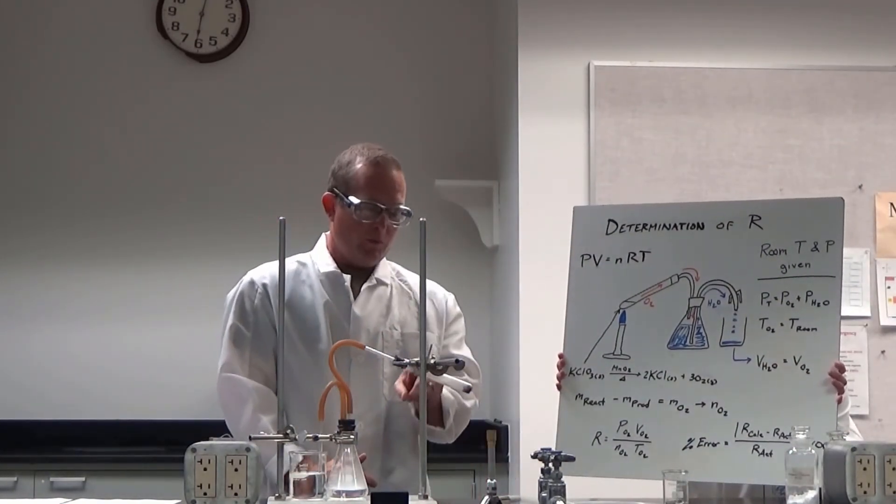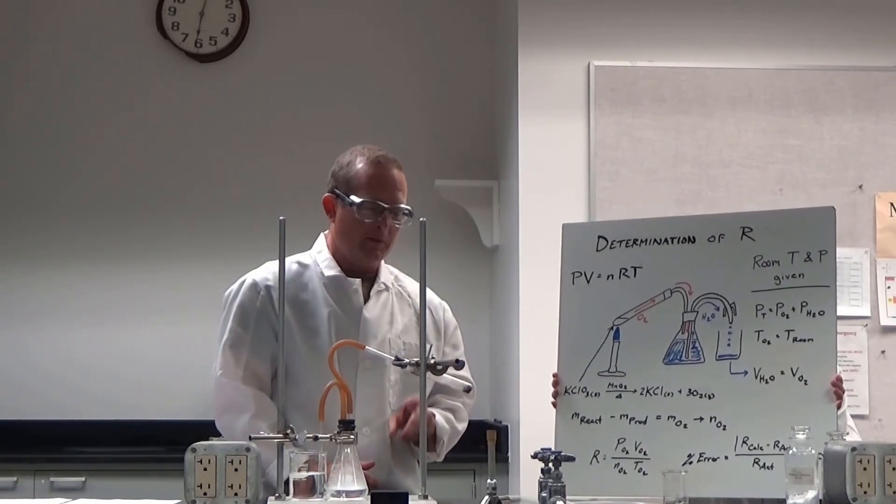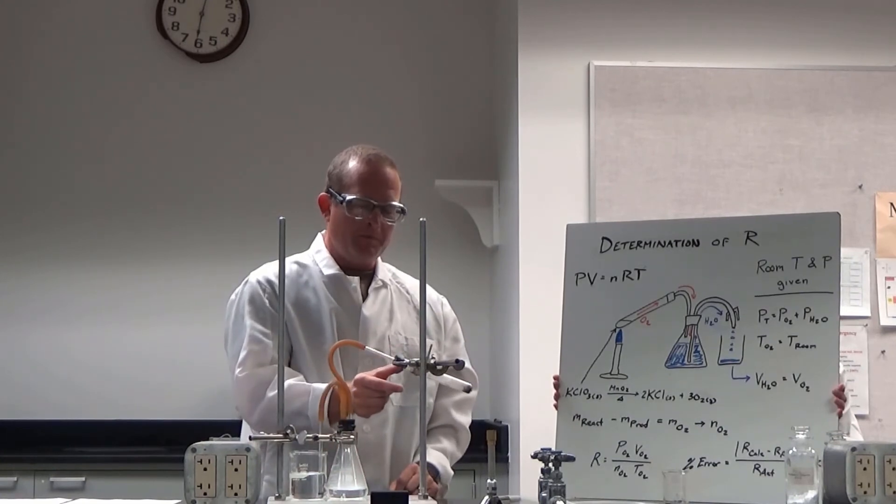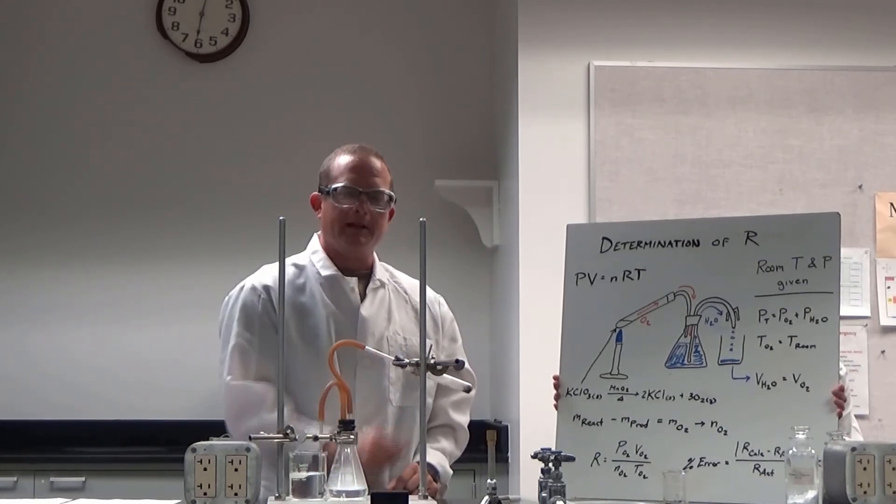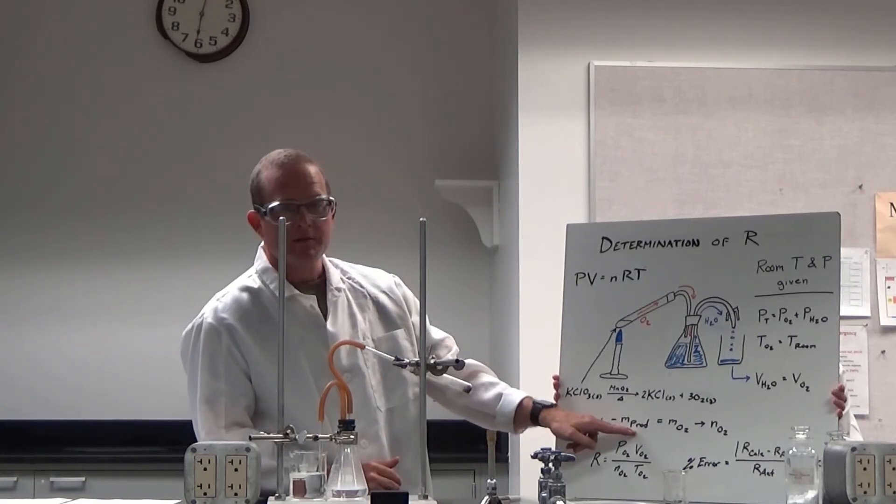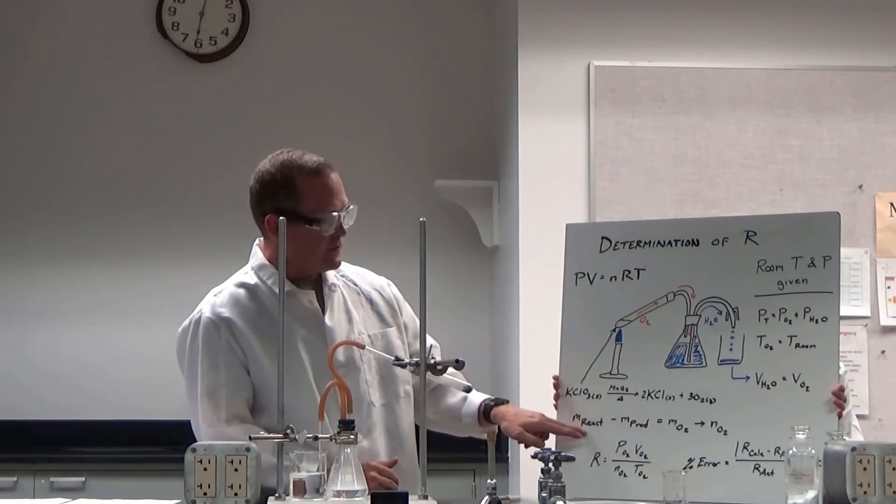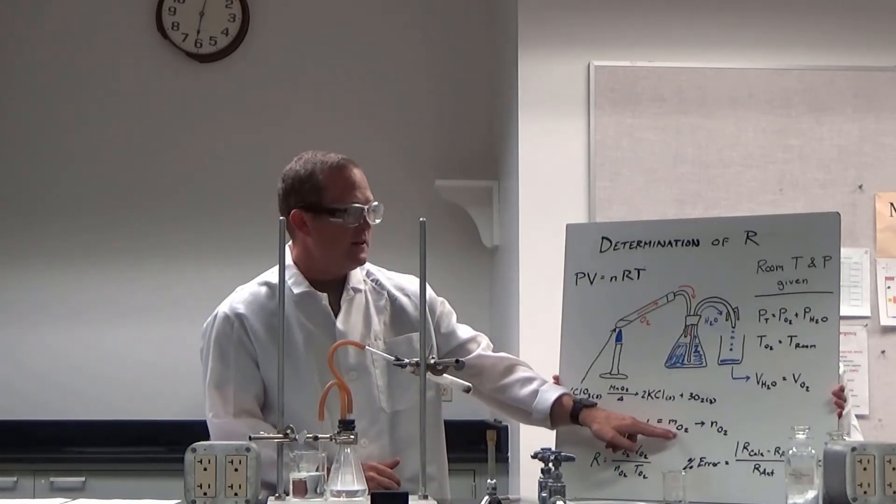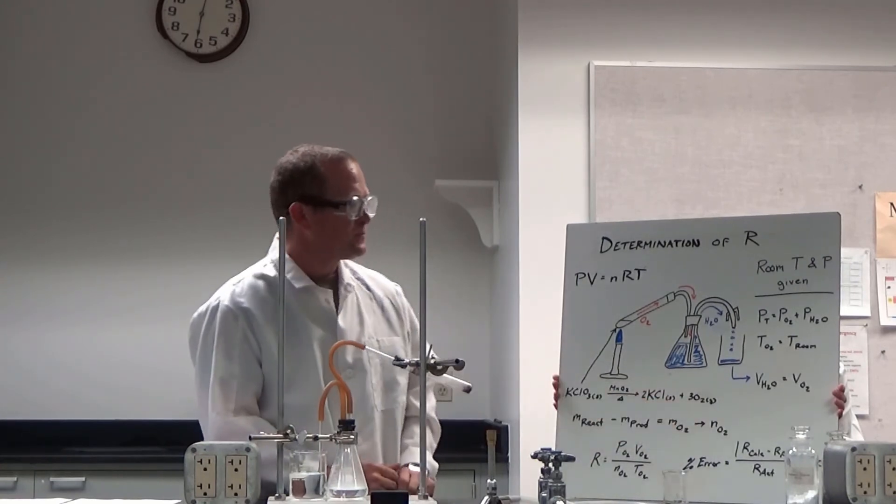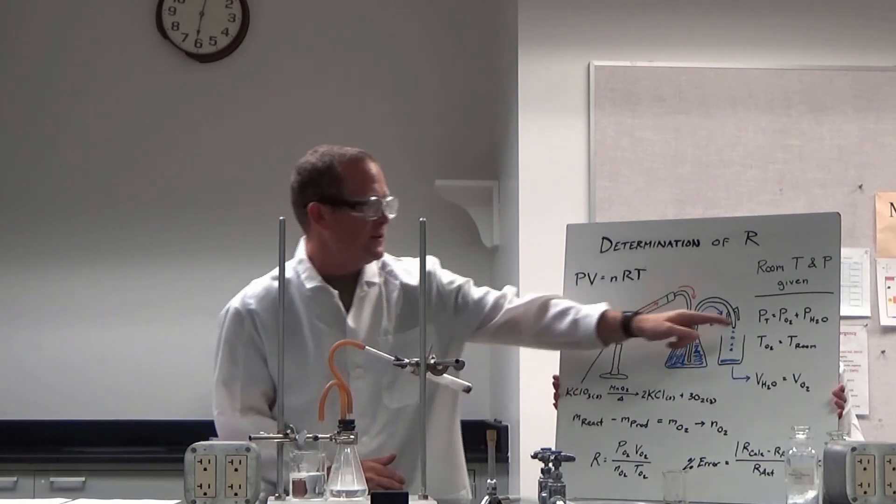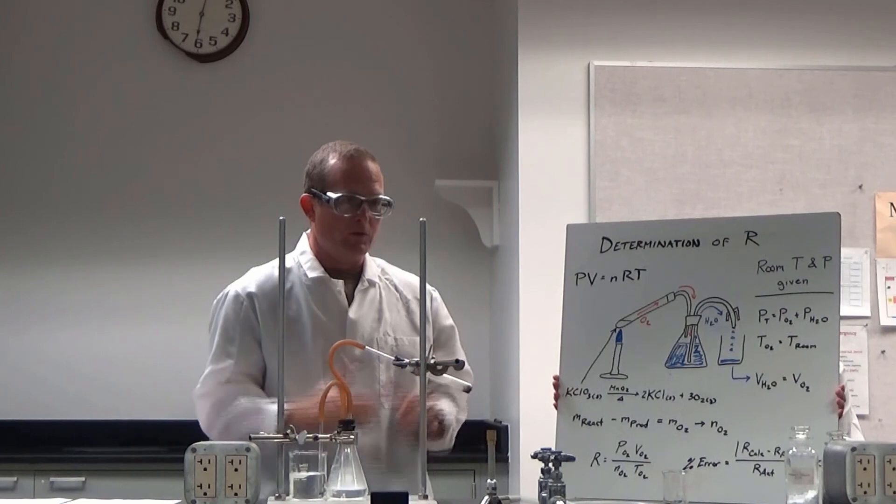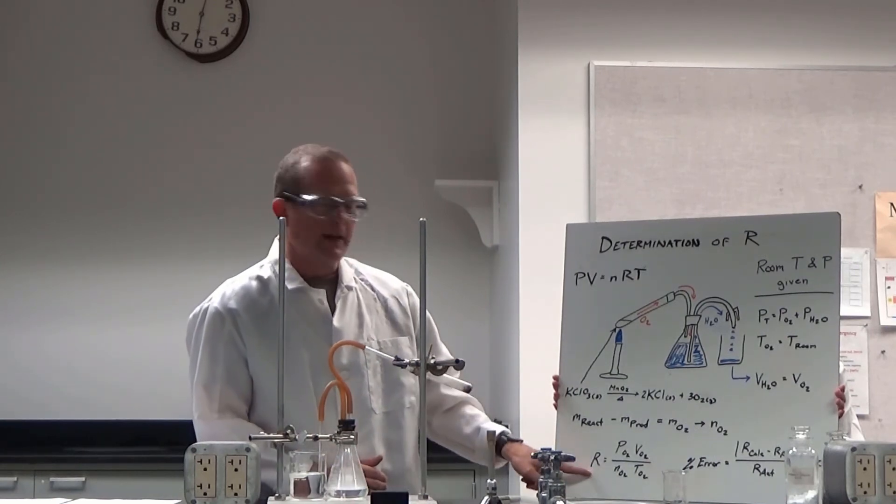We need to wait until this tube is cooled, of course, because remember hot glass looks the same as cold glass. So once that's cooled, we can go ahead and take the mass of the ignition tube again. Now we're taking the mass of the products. So subtracting the mass of the products from the mass of the reactants will give us the mass of the oxygen gas. Again, through the molecular weight, we can determine the moles of the oxygen by knowing the temperature and pressure that are the room temperature and pressure today. We can determine the gas constant.